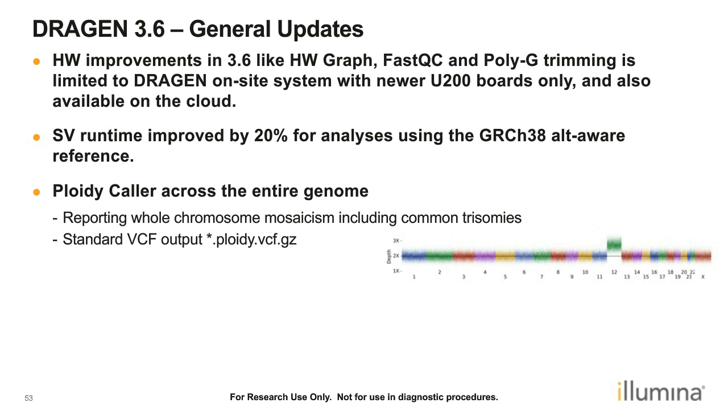It's a file that is per chromosome, and you can see in this example that we are showing here, the coverage is 2x for the whole diploid human sample, but there is a trisomy that you can see here in chromosome 12. This is something that we have put out as a separate VCF file that you should automatically see when you run our pipeline. So that's something that you will see as a new feature.